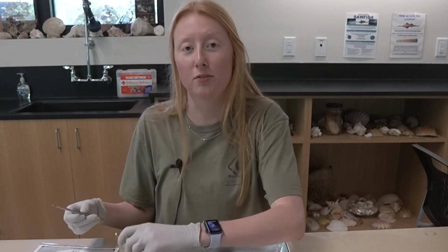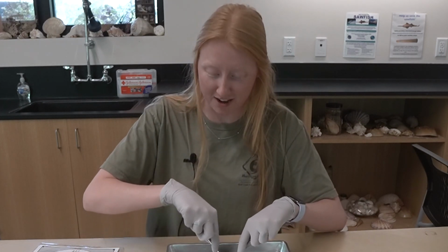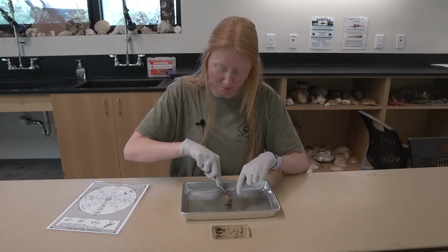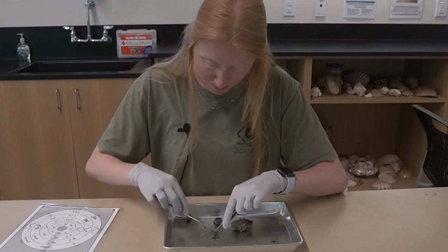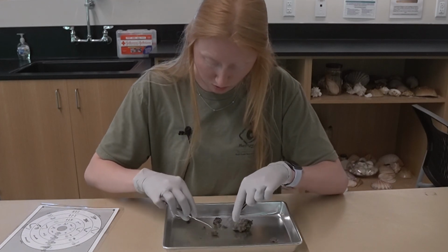There's no right or wrong way to do it. You just kind of try and break it in half and see where you can go from there. And there's lots of bone in here, so it's going to make it a little bit more difficult to try and bust open. I am going to try and see what big pieces of bone I can find. That's always the most fun part, are big pieces of bones.